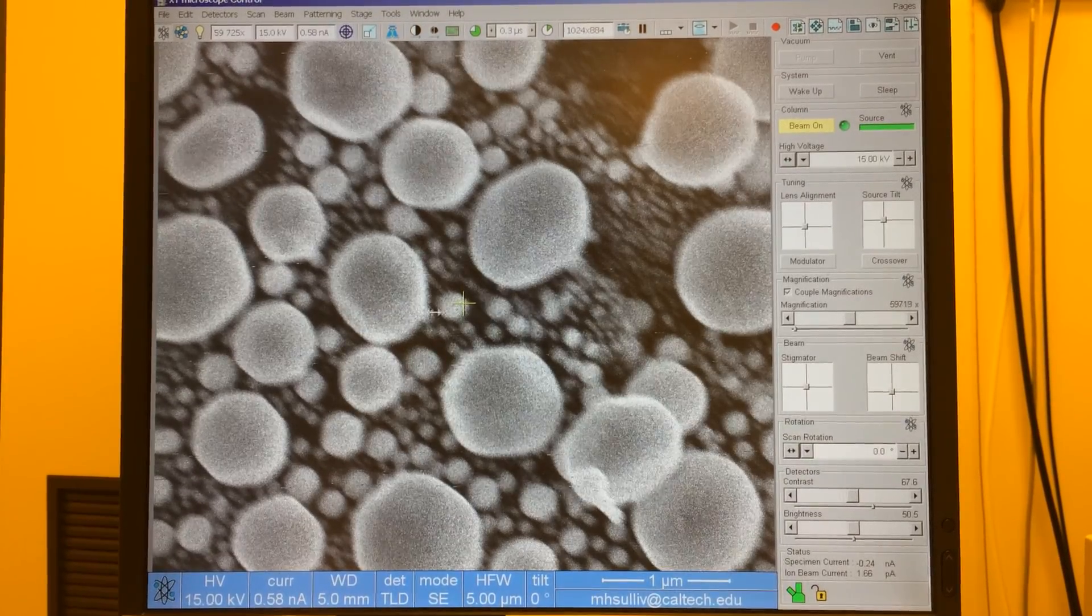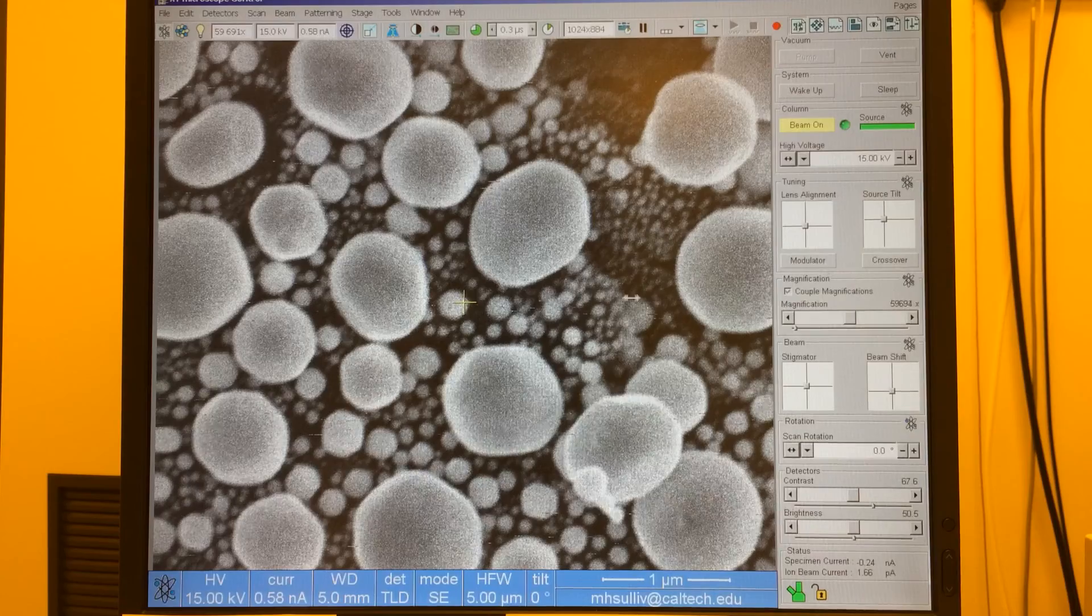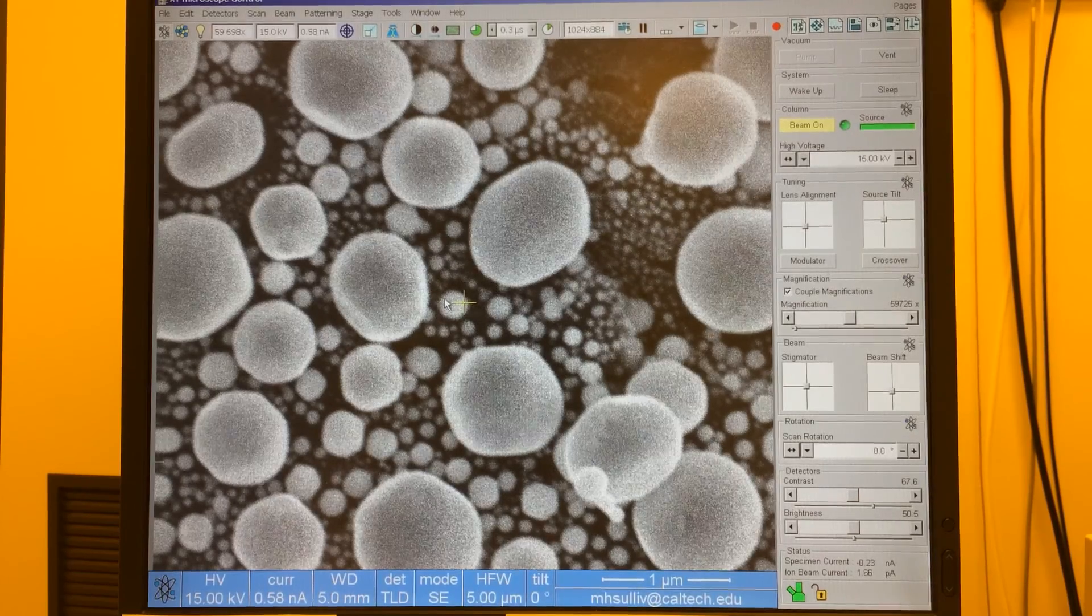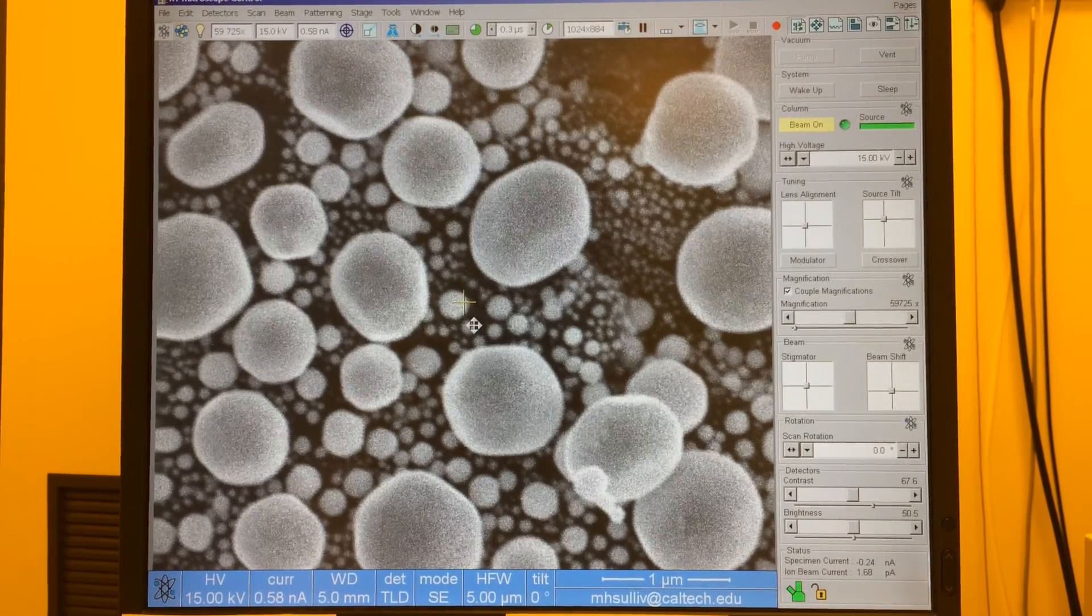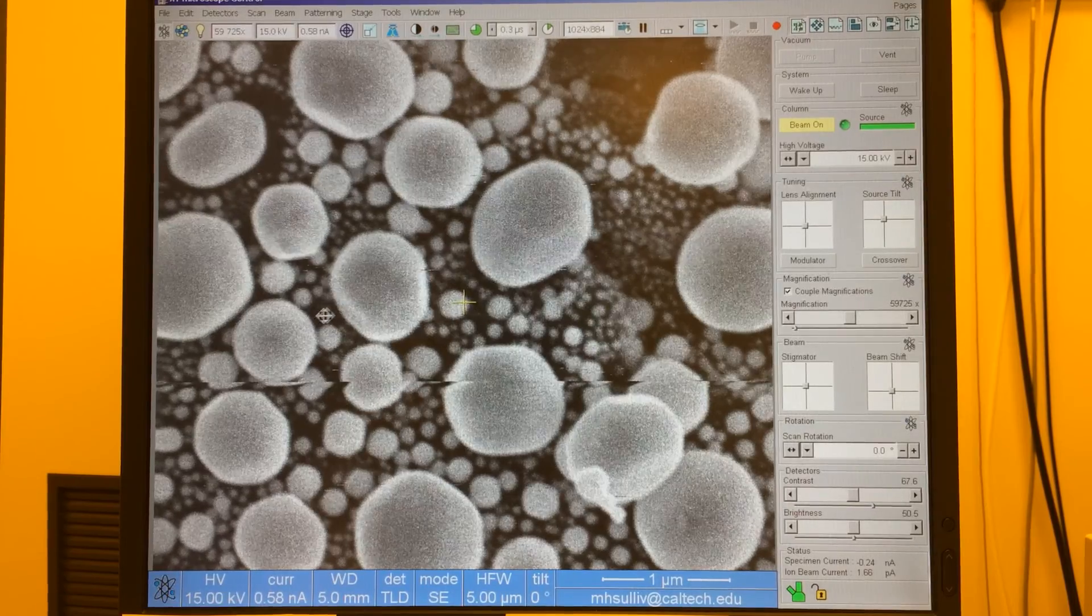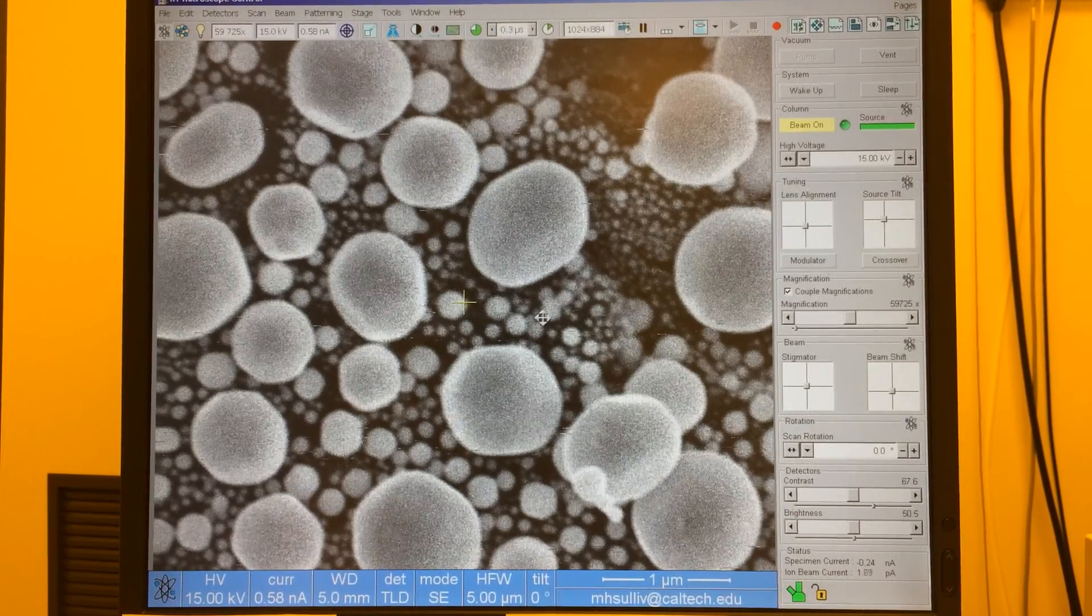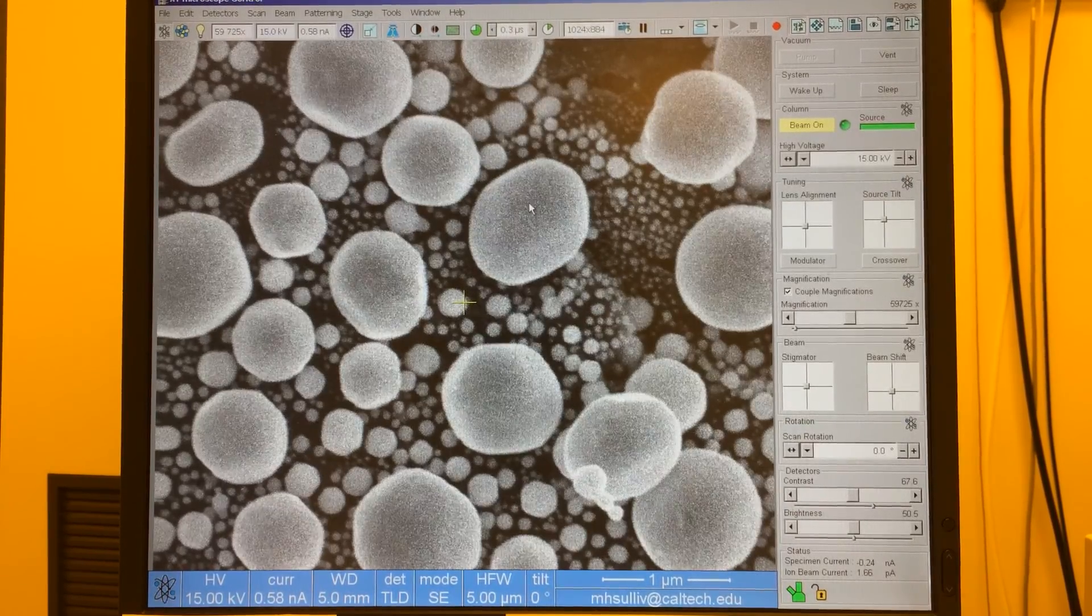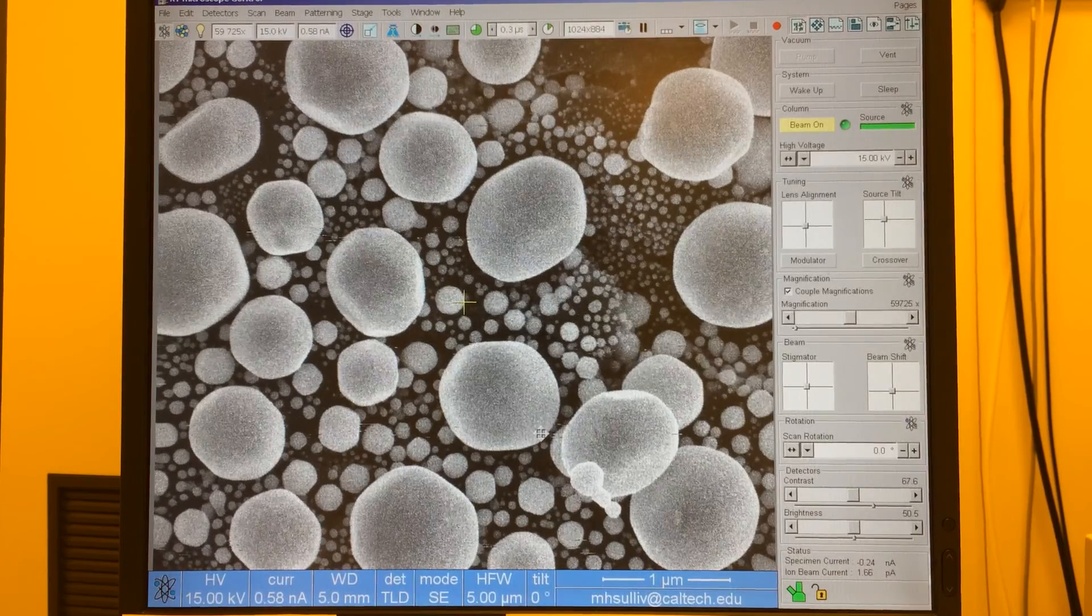To fix that we know we want to go somewhere in the middle where there's no stretching. It's equally blurry along all edges of a particle and then shift right click and move side to side for x astigmatism, up and down for y astigmatism to get a sharp image.